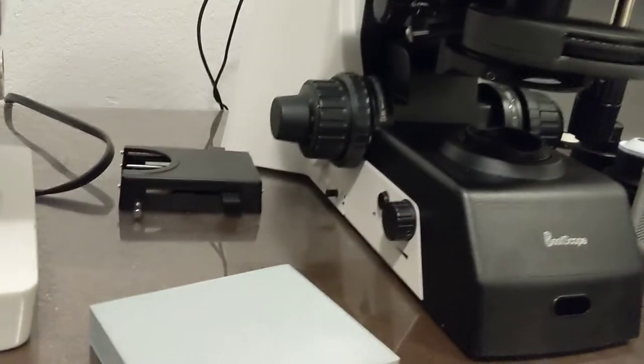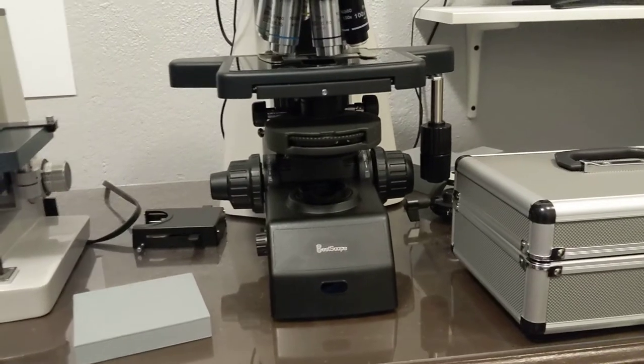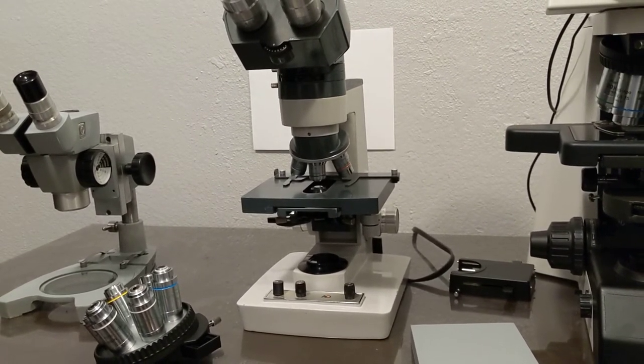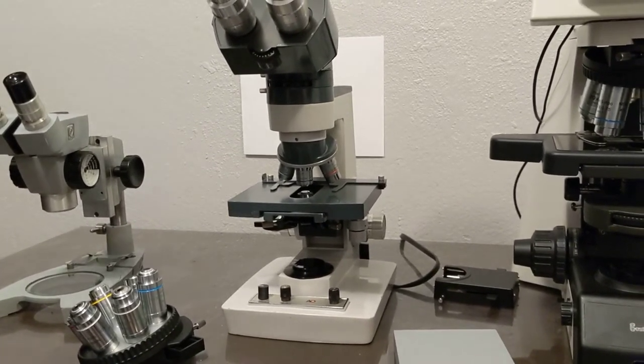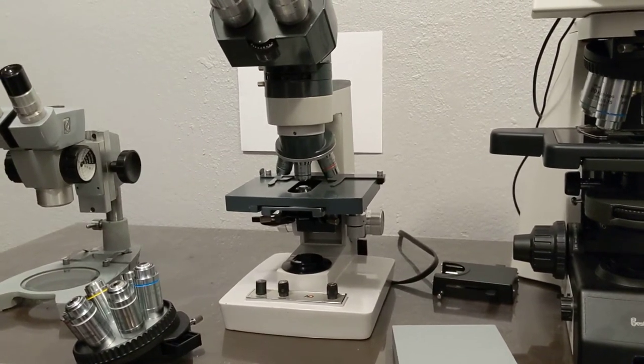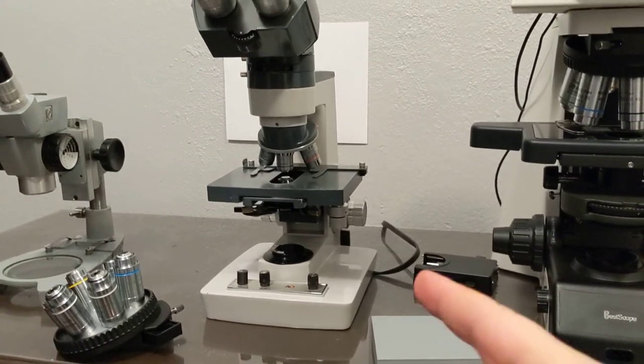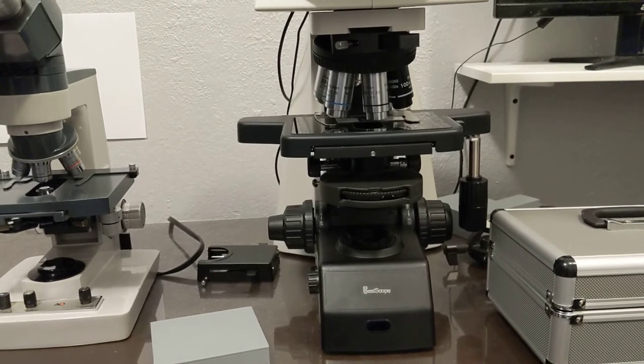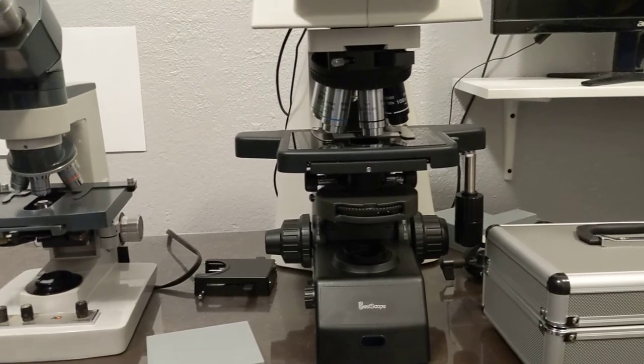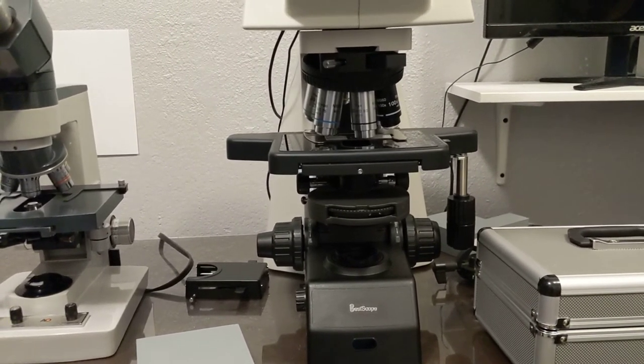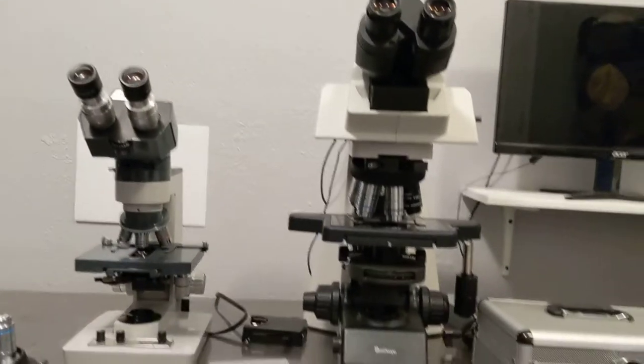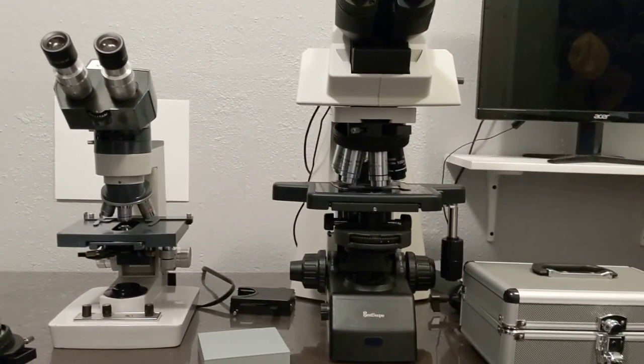Here is the controls for the field diaphragm and the brightness. Here we have one filter built into the microscope, a neutral density filter. But it's not needed that much. With the American optical, I have a 20-watt halogen illumination. When you start it up, even at its dimmest setting, it's too bright to use at 4x. On the other hand, the 3-watt LED system in this Best Scope gets very, very dim, dim enough that you don't need a neutral density filter. And if you turn it up, it gets as bright as staring into the sun. The color temperature doesn't change that much either. I'm extremely happy with this LED system.